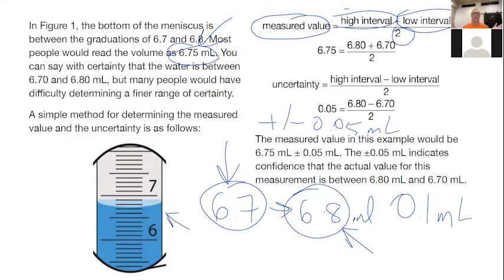Maybe you would measure the mass of the liquid rather than its volume, which is something we're actually going to do tonight, because we know we can measure the mass more accurately than we can measure the volume, because we have our scales. We don't have to rely on our judgment in looking at the meniscus. If we use it properly, we should get more accuracy than that. And that is actually how we're going to be checking our work tonight.